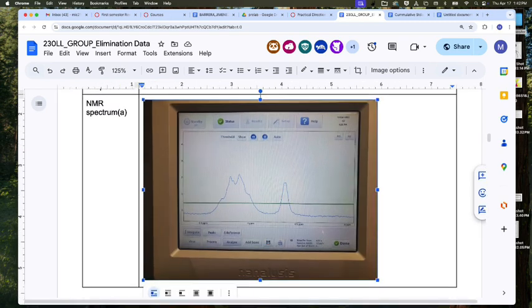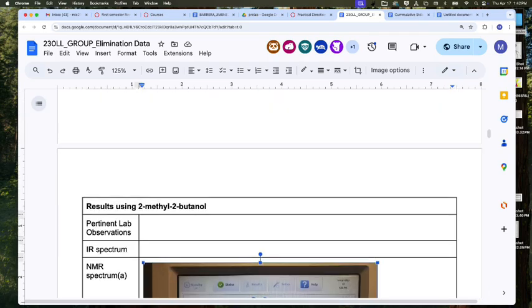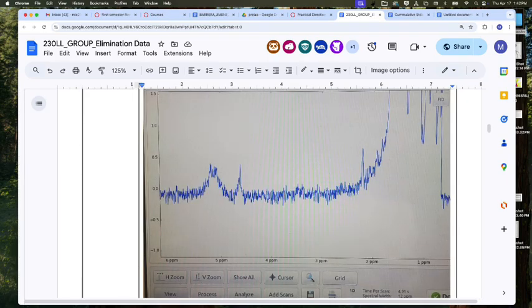Okay. Here we're seeing these smooth lines to these peaks, whereas up here we've got all these jagged lines. Why? It actually has nothing to do with the purity of the sample. It has to do with how much. Those jagged lines are because there's very tiny amounts of the product actually in the NMR tube to be tested, which means what the instrument is seeing is hardly anything to pick up a signal.